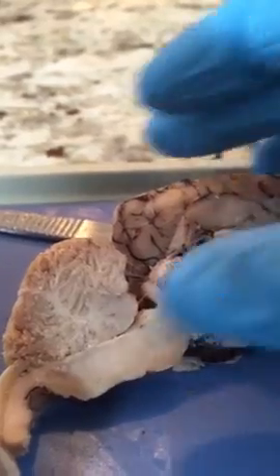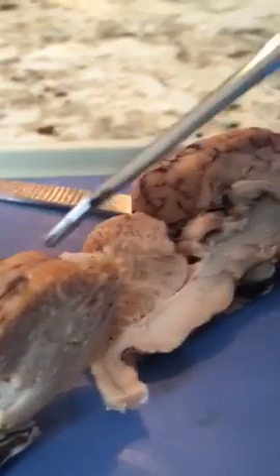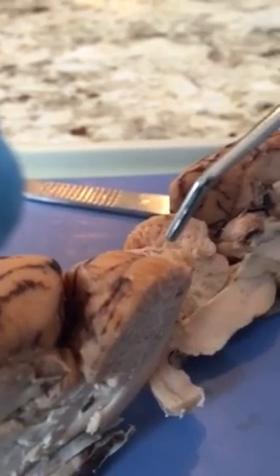The cerebellum, the vermis of the cerebellum on top here. It's weird looking through the camera at me using the scalpel.